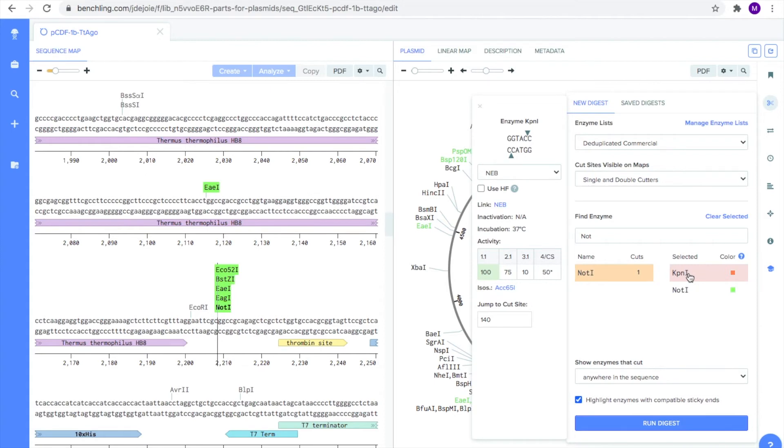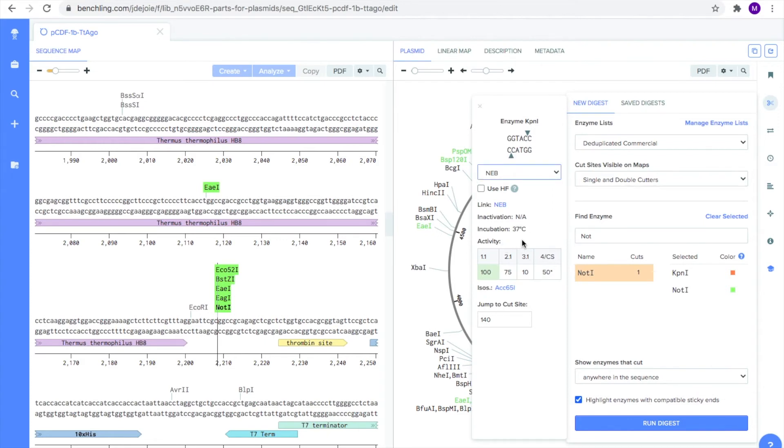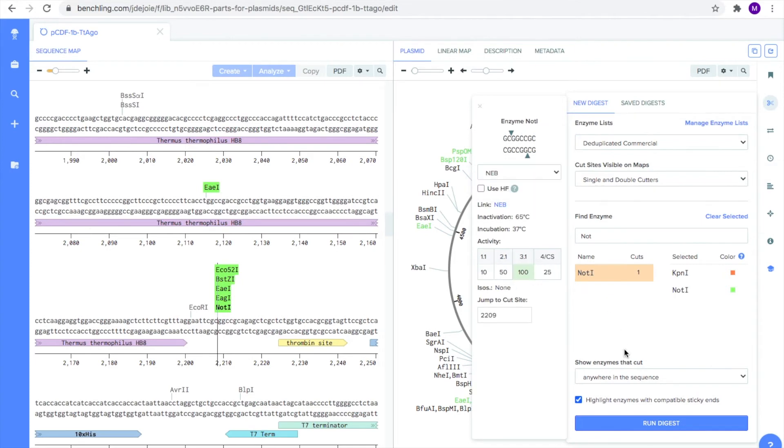Notice when you put a cursor on the enzyme name, there is a panel on the left that shows between which base pairs the enzyme cuts. It also provides you the incubation and inactivation temperature of your enzyme, depending on your providers, such as NEB, ThermoFisher, and Promega, which are all companies you can order restriction enzymes from.